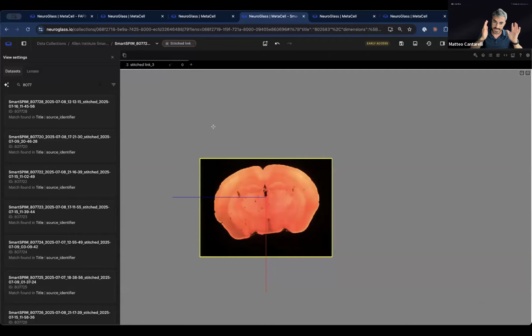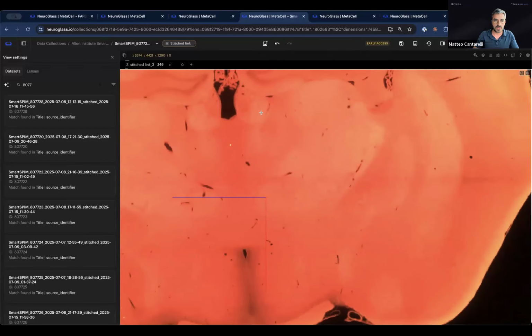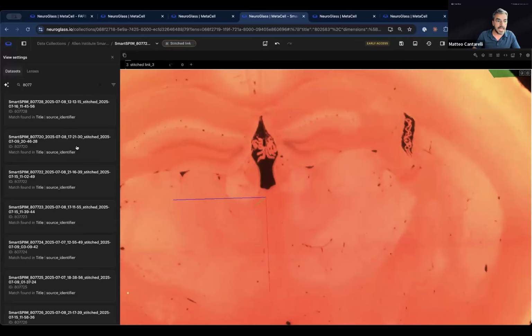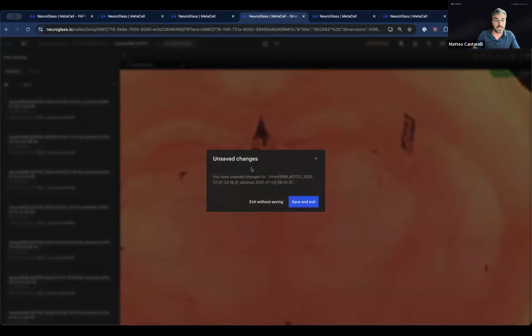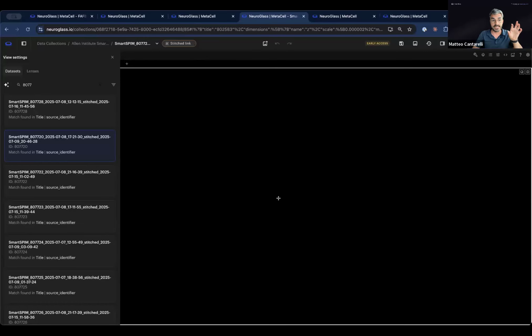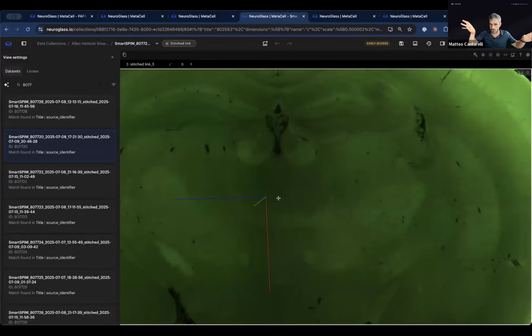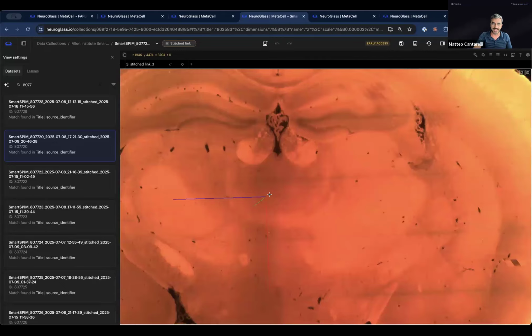And we separated out the data from how you look at the data. And how you look at the data, we are calling lenses. So what does that mean? It means that I come here, I'm interested in a particular area, and I just click on a different data set, and with a single click I am able to go precisely to that position, precisely to that visualization. And this does not require anything complicated.